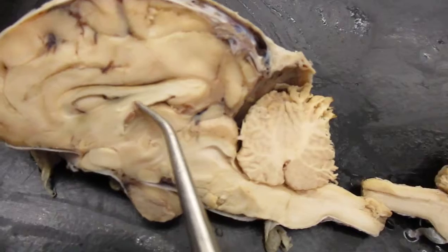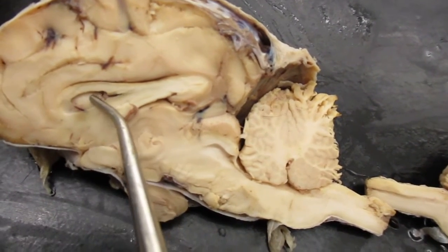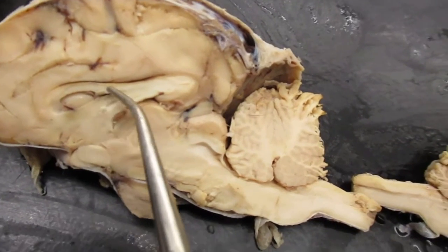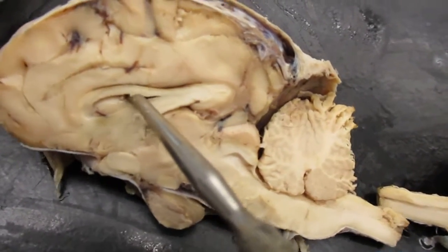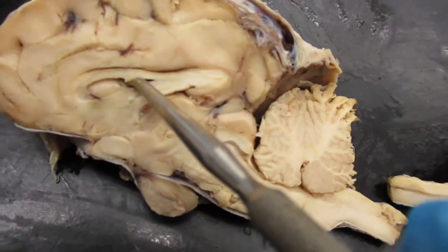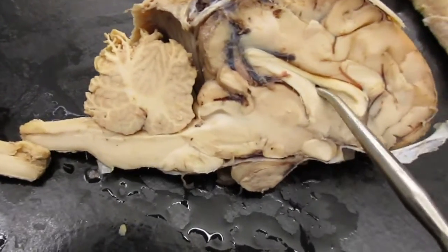Let me show you on this hemisphere. Corpus callosum, clear septum, and fornix. Now, if you stick the probe in here, you can see that this is the lateral ventricle. Lateral ventricle right in here.